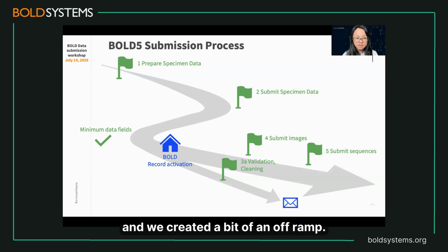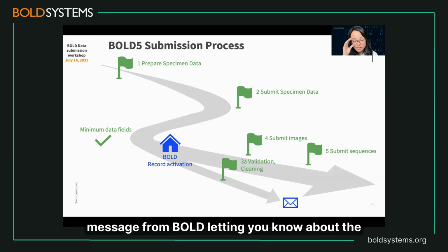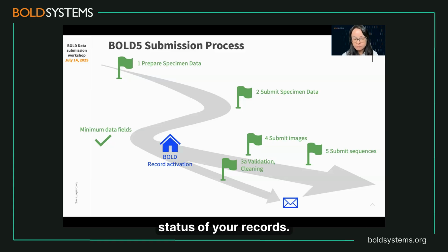And we created a bit of an off ramp. In parallel, while that is happening, you're still getting automated validation and data cleaning, and you will receive an automatic message from BOLD letting you know about the status of your records.